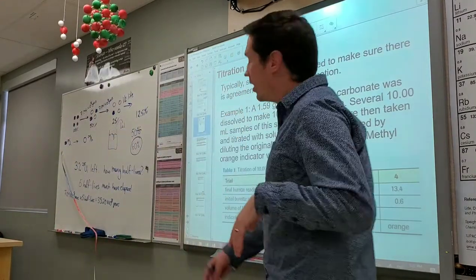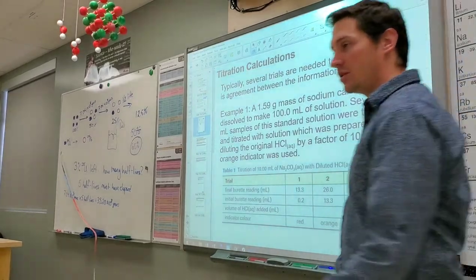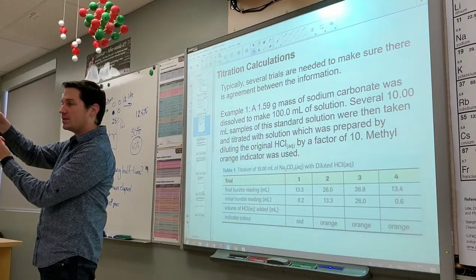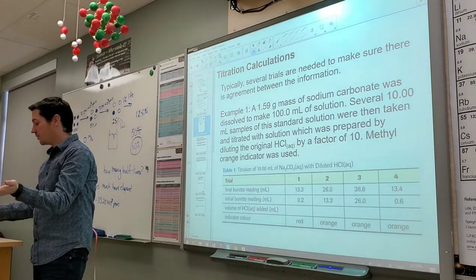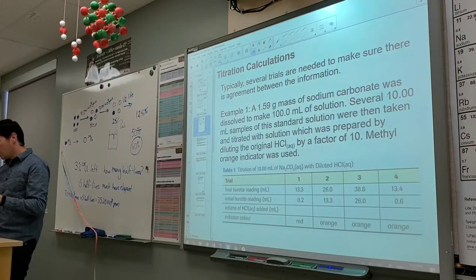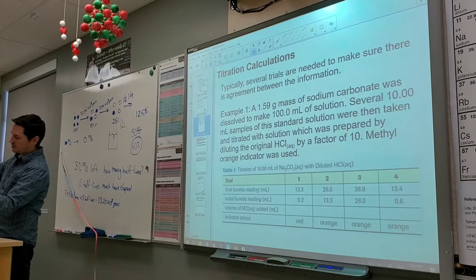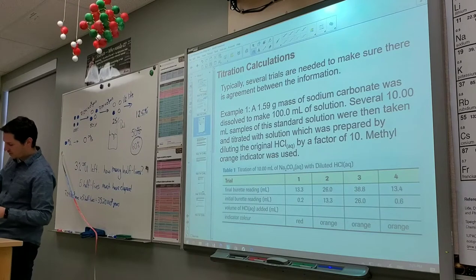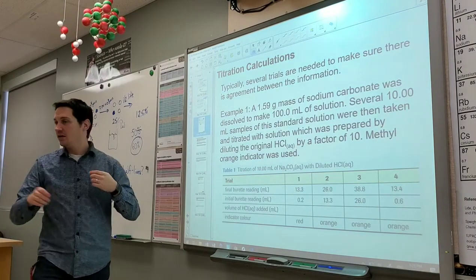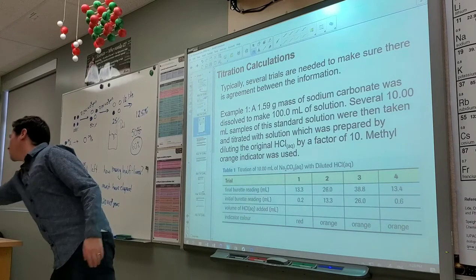So let's think about an example. Typically, several trials are needed to make sure there's agreement between this information. So if I get a good color change or a good endpoint in one titration, I'll make sure that I use that information in my analysis. And then I'll dump it out, right? You go to a waste beaker, you dump it out, you rinse out your Erlenmeyer flask, and then you start all over again. You do another titration. We want 3 trials.